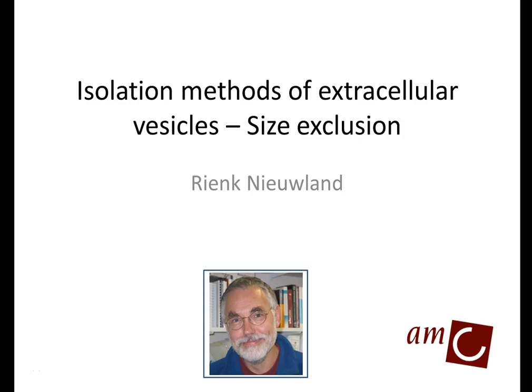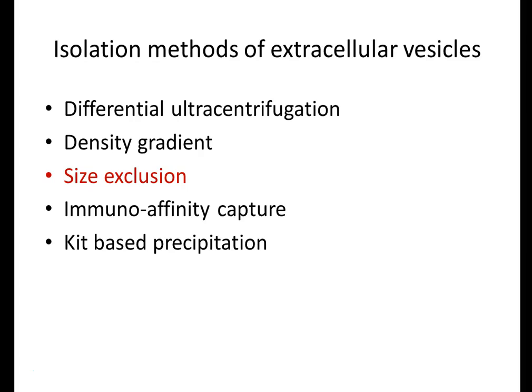I would like to tell you something today about the isolation of extracellular vesicles. In particular, I would like to discuss size exclusion chromatography. Now, I'm sure you know that there are several methods to isolate vesicles from human body fluids, and most widely used are differential ultracentrifugation and density gradients.